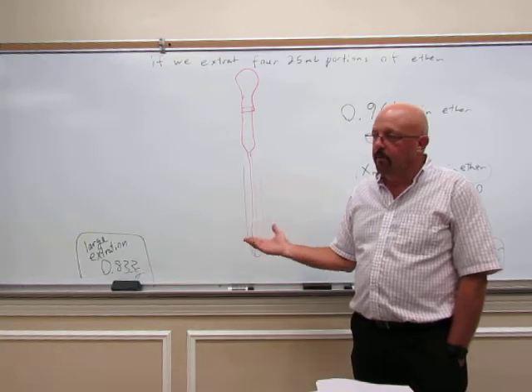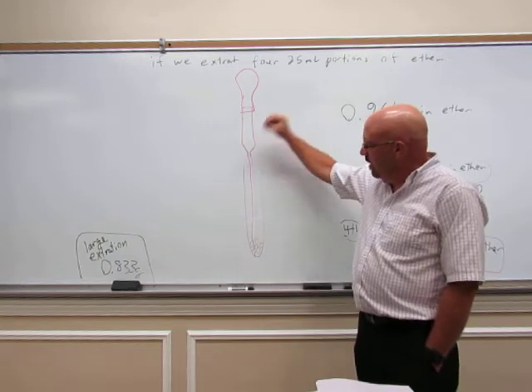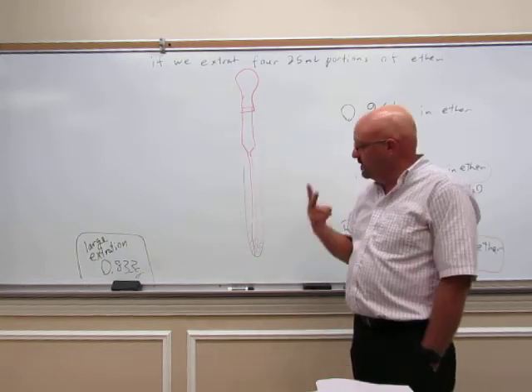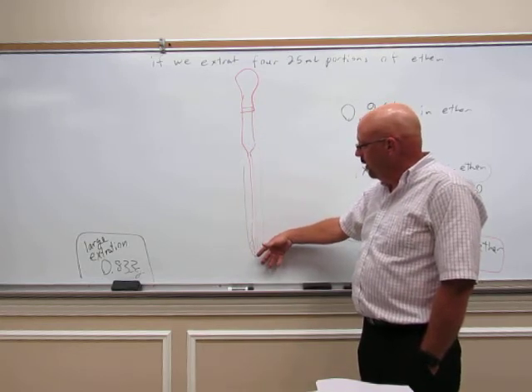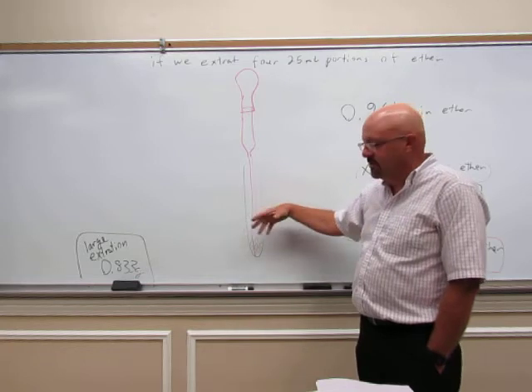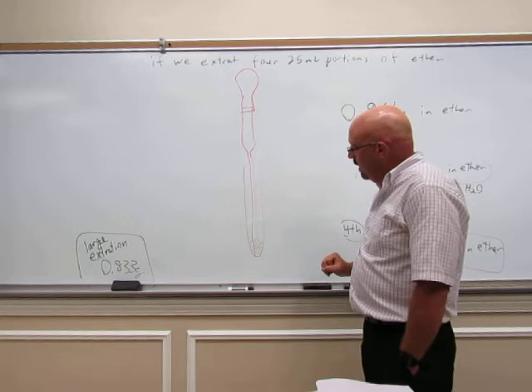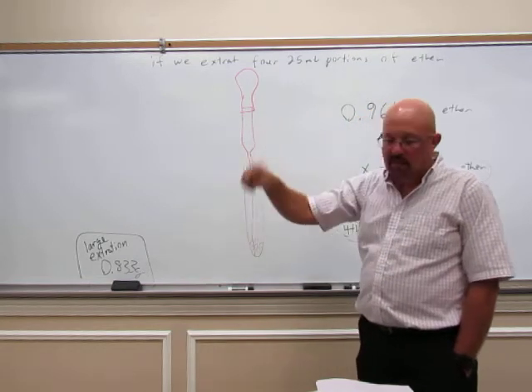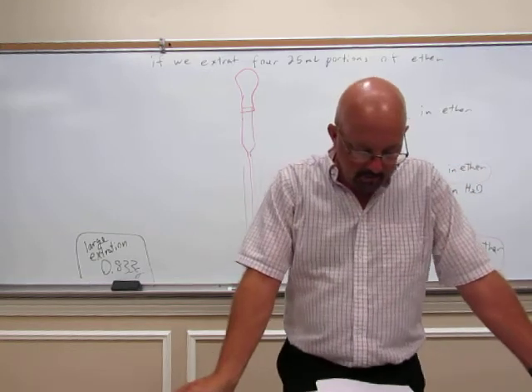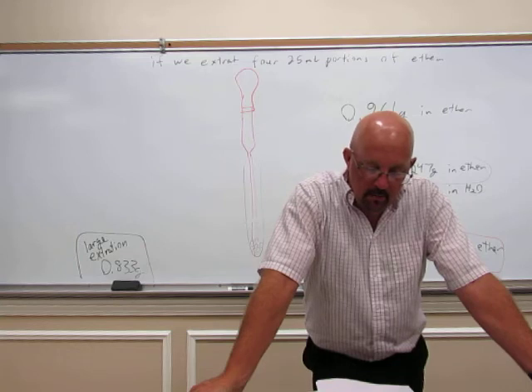0.1 mL or 0.2 mL, something like that. Put that in there, you're going to wash it, suck that up, put that in your Erlenmeyer flask. It said do it twice, put another 0.1 or 0.2 mL in there. You don't have to measure it out, it just said wash them a little bit. We're just trying to make certain we get everything off our pellets and into the Erlenmeyer flask. So a little bit more, suck that up, and get that into the Erlenmeyer flask. That way we've got everything loaded into the Erlenmeyer flask.